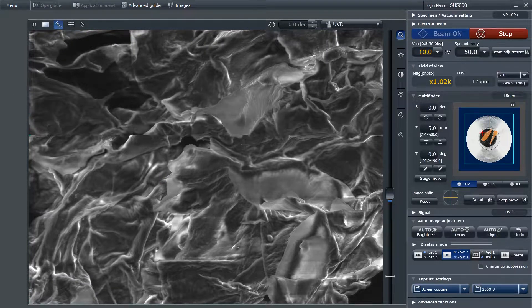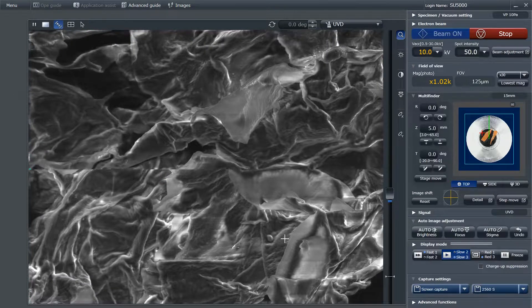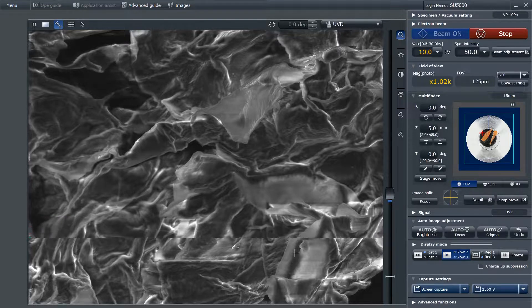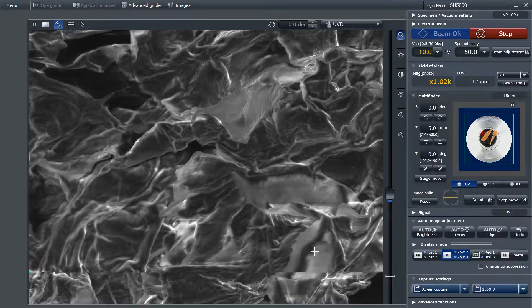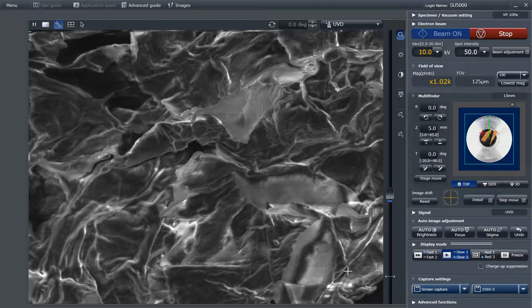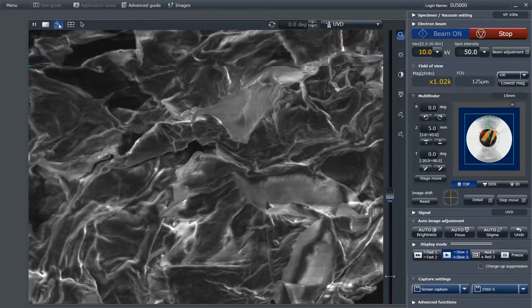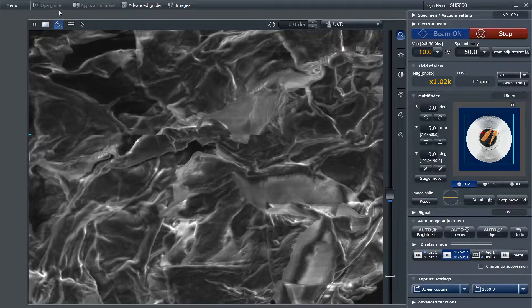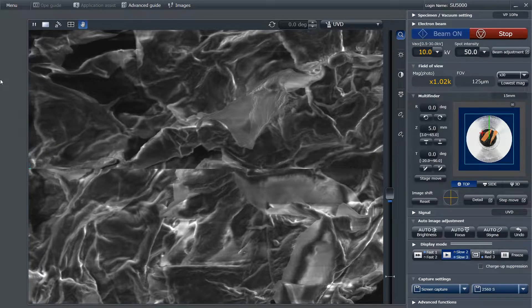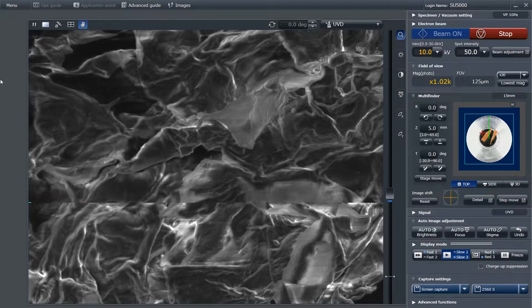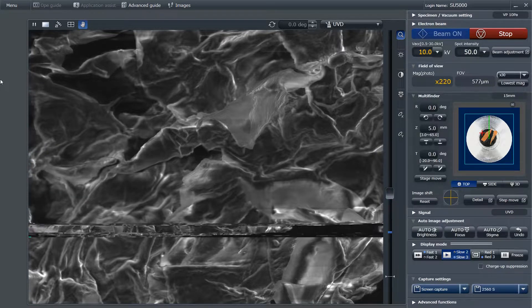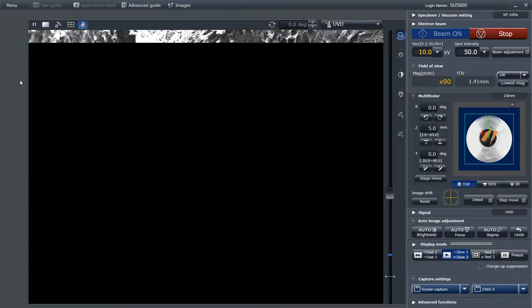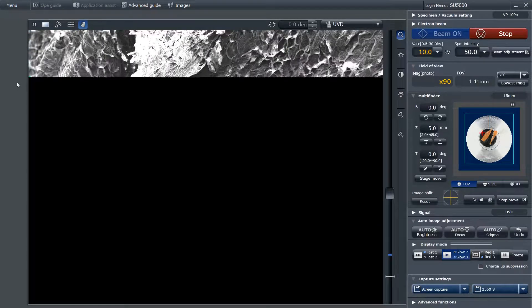Now I want to make a measurement of how large that object in the bottom right is, and I think it was approximately 46 micrometers. But due to the recording software that I'm using, that didn't show up, since I'm only capturing the actual viewing window.